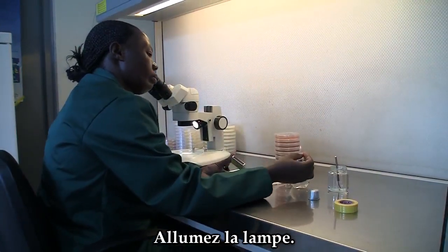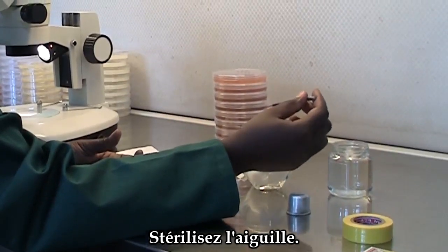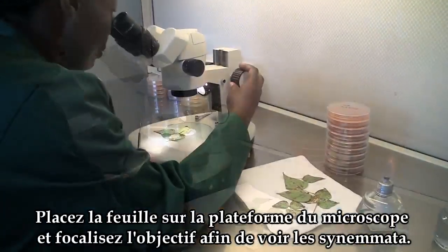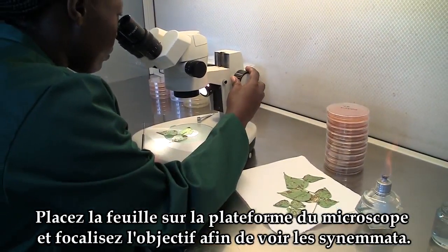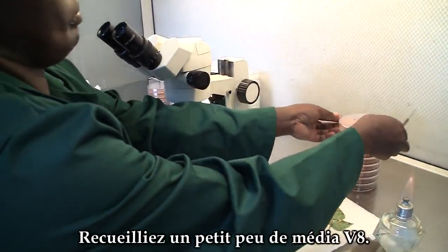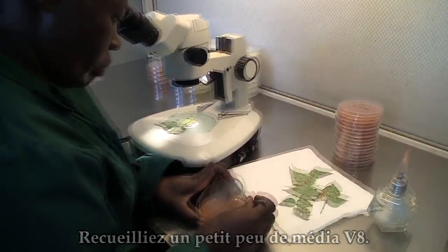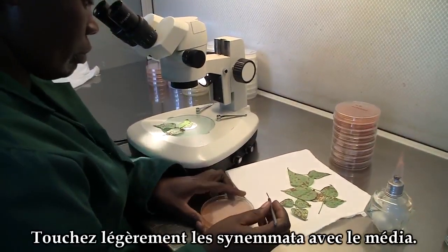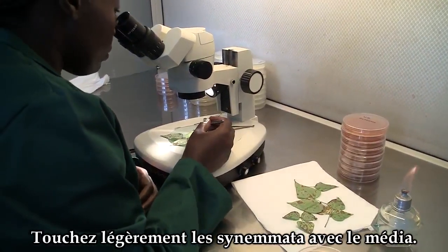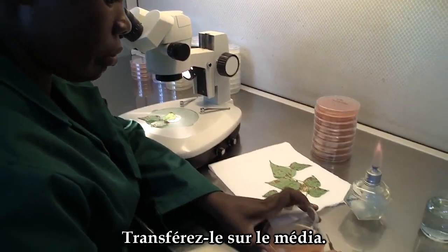Light the lamp and sterilize the needle. Place the leaf on the stage and focus to see the conidia. Pick a small piece of the media and use it to slightly touch the conidia. Transfer this onto the media.